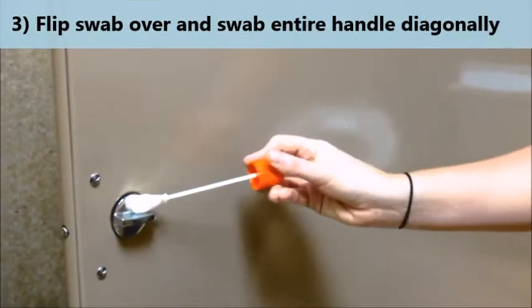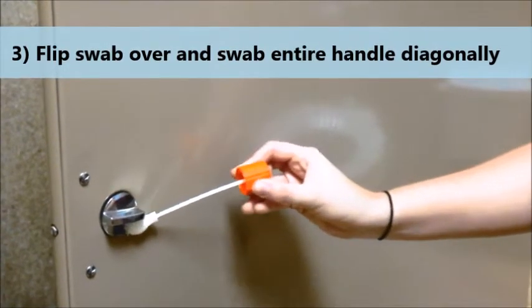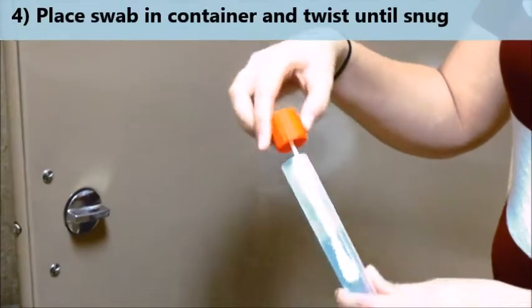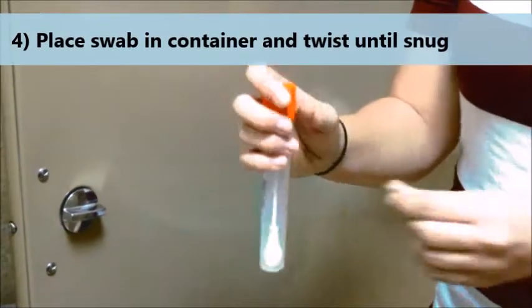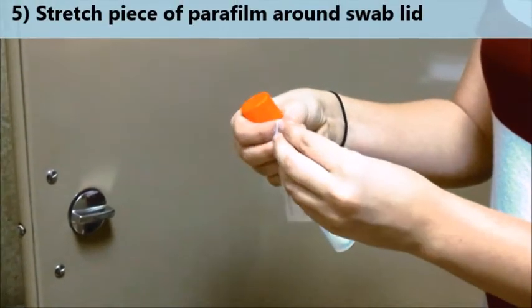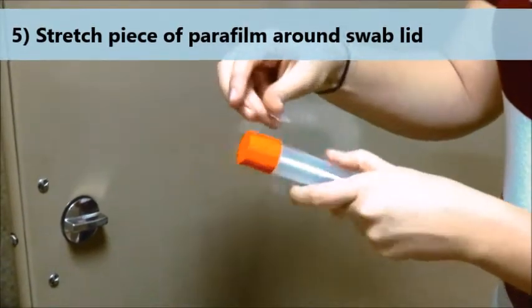Flip the swab over and swab the entire handle again in a diagonal direction. Place the swab back into the container and twist the lid just until snug. Take the parafilm and separate the plastic from the paper. Stretch the parafilm around the lid in order to form a seal.